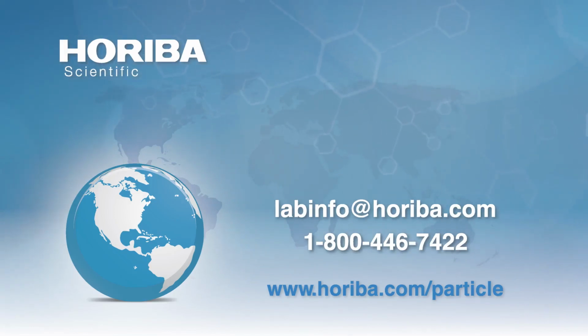Yeah, years ago I was working with HIV. Back in the mid 2000s, I worked for the Gates Foundation on a project for developing a vaccine, and we measured the zeta potential of HIV, because what we were looking at is basically how to combat HIV.